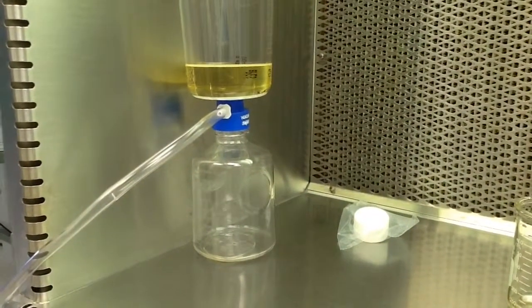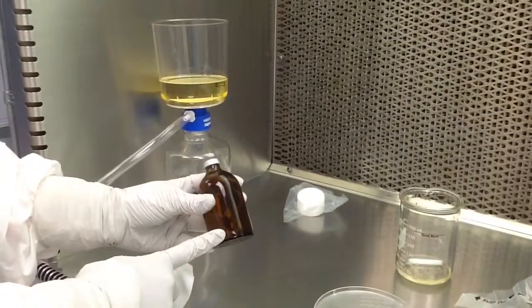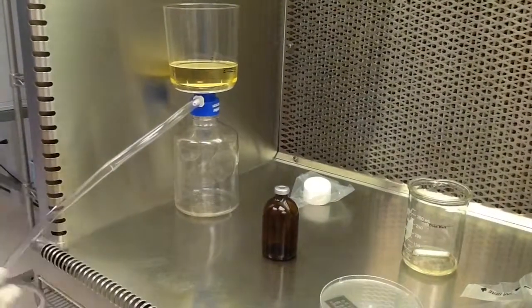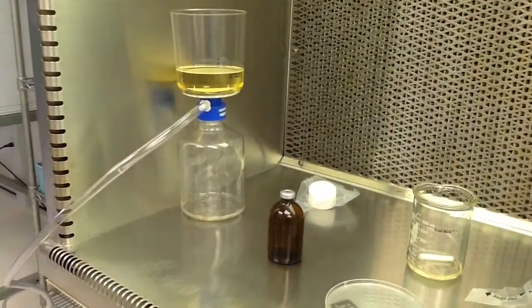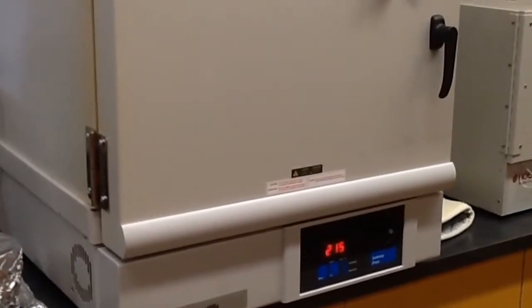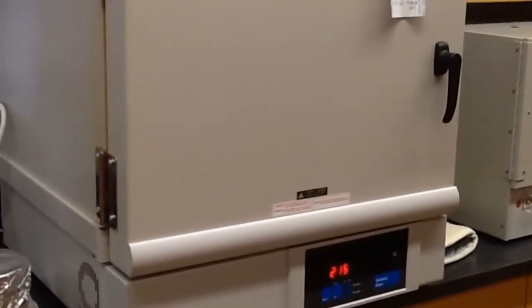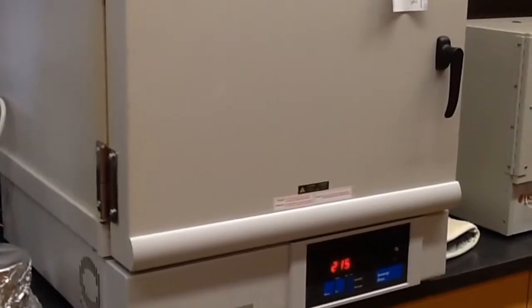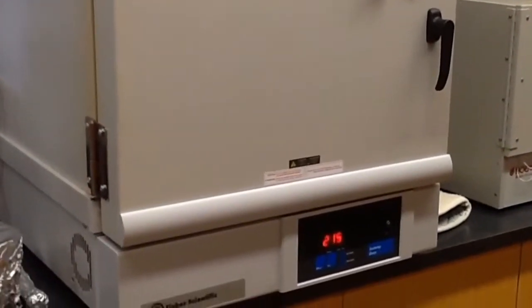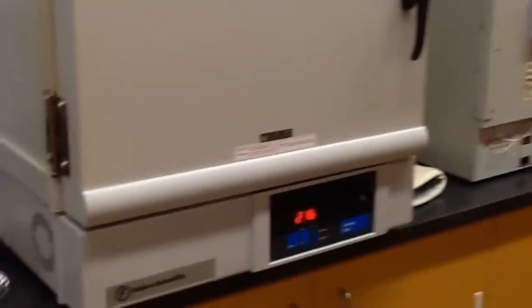After it is completely gone from here down to here, I will put the oil in these vials, and then we reseal them and cook them in the oven. So that'll be our next step. And the last step of our cyclosporine eye drops are to be cooked in the convection oven. This is a dry heat oven, and it's used to cook oil-based products. I will cook the product at 150 degrees Celsius for 2 hours and 30 minutes.